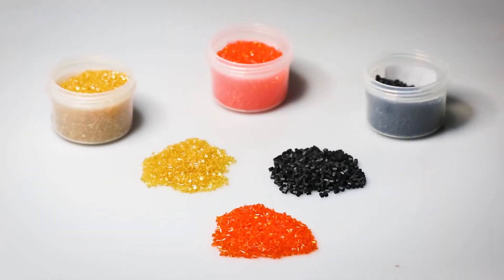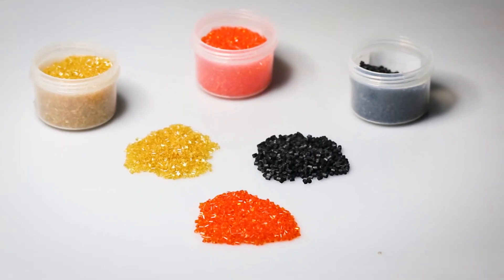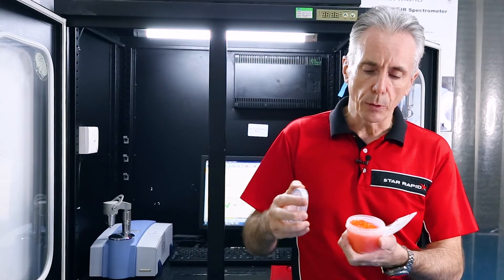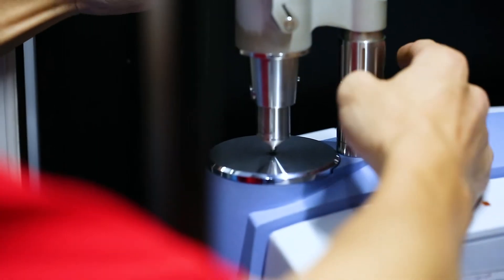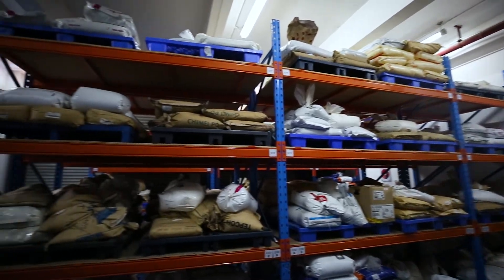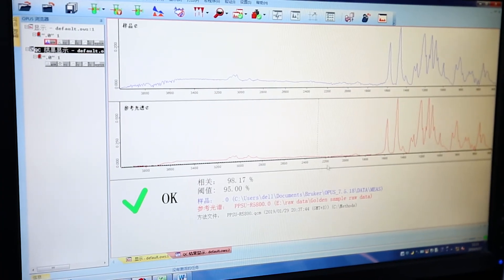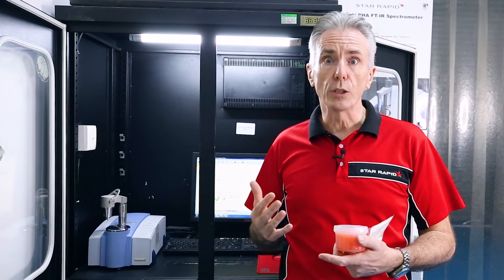These fingerprints are unique to that organic material. To calibrate the machine, we get in touch with resin manufacturers all over the world and purchase the original material from the original manufacturer. We take one of these and calibrate the machine from it. We then test the incoming material against the golden sample and it must test better than 95% — we can then guarantee that it is the original, correct material.